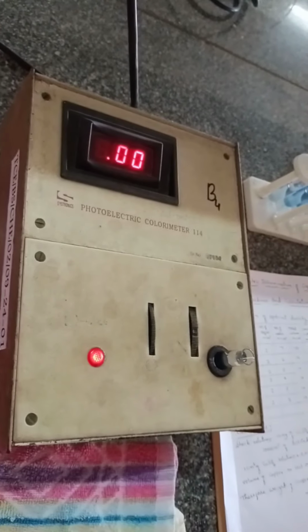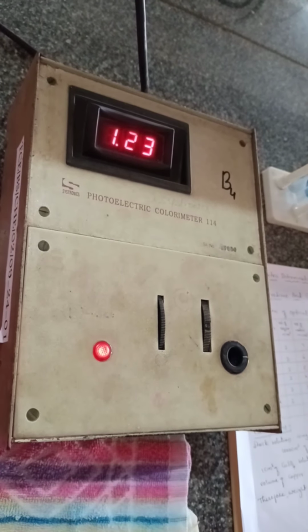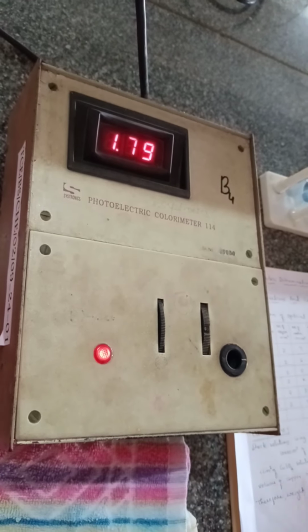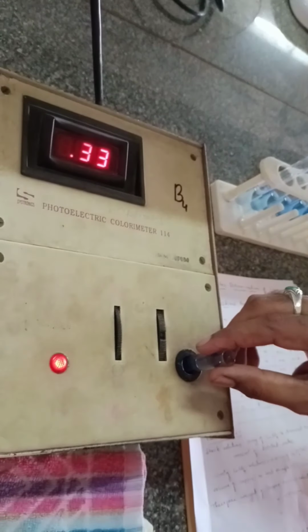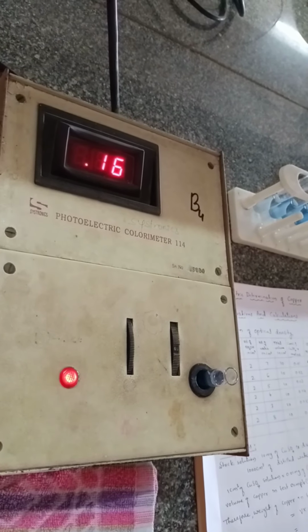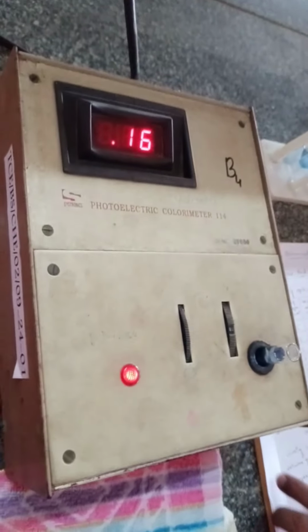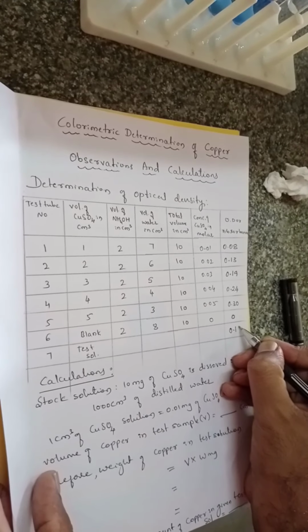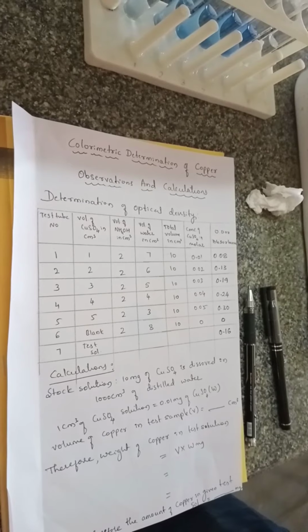So it is 0. Now take this test solution in the cuvette and insert it in the instrument. It gives 0.16 as the absorbance value.